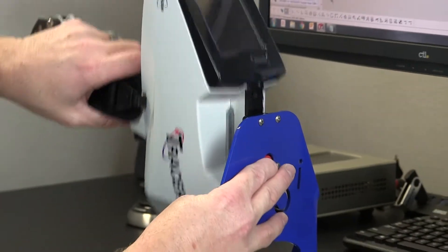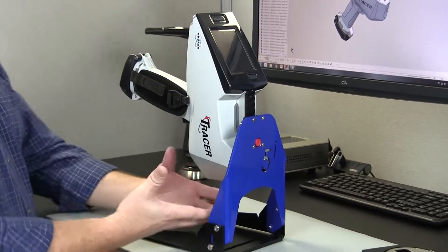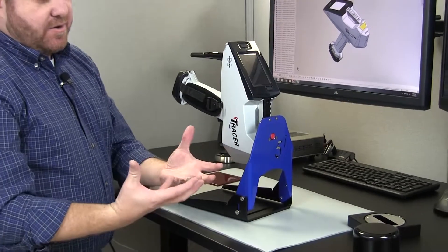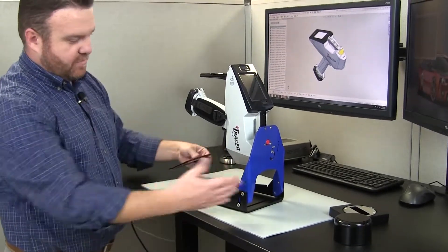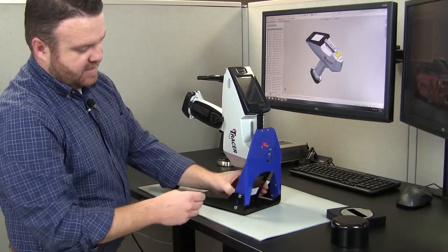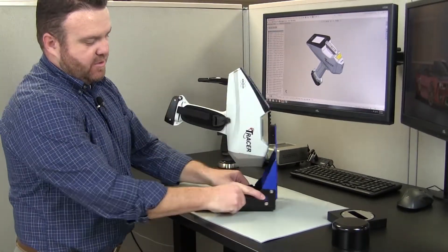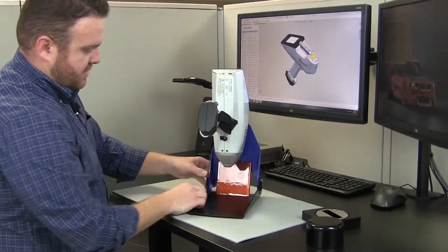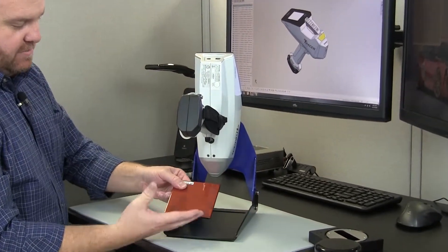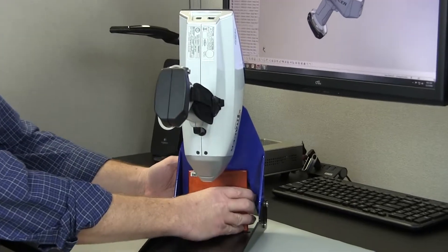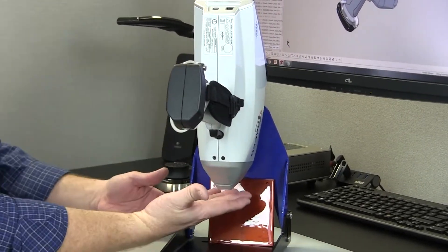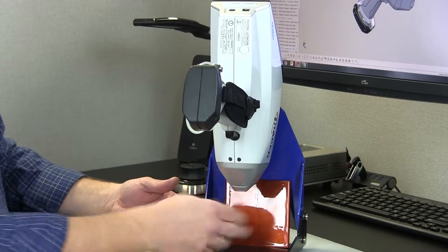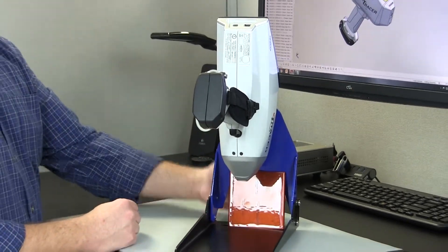In some cases where you have types of material that might be powderous in a bag, even though it's up against the sample surface, you want to protect for the x-rays in the back. This component here is what we call the backing plate or blocking plate. It sits in that groove in the bottom and rests against the top, so you can put powderous material here and it still has protection out the back for the x-rays.